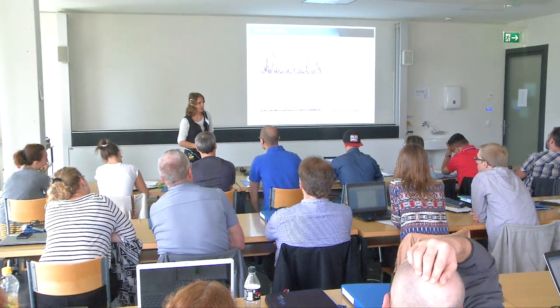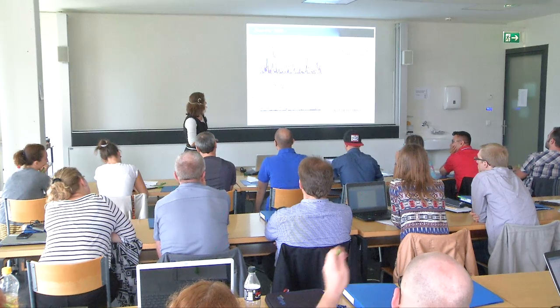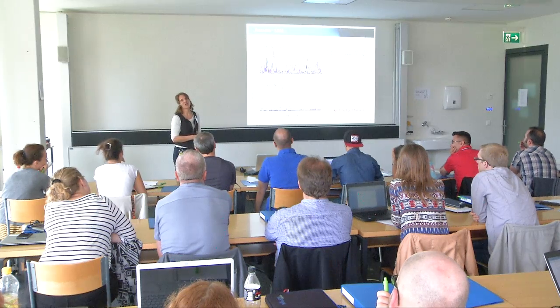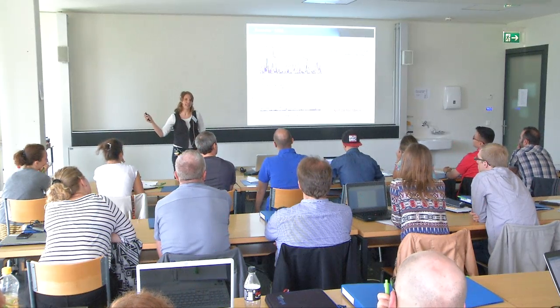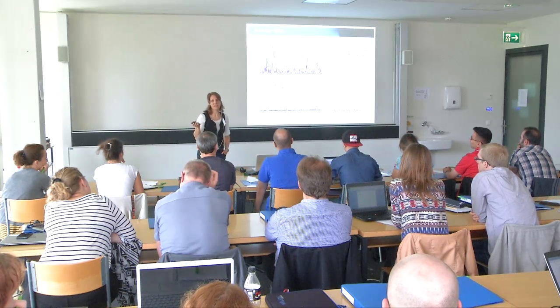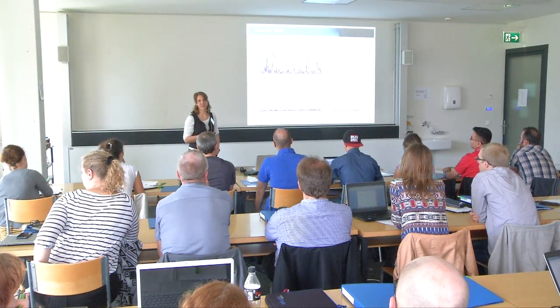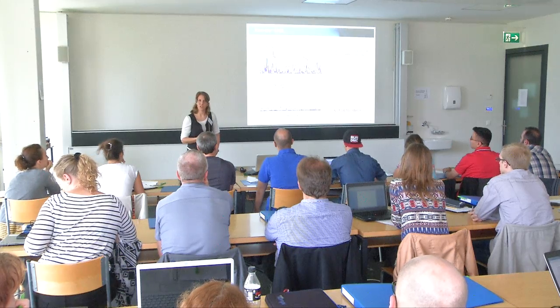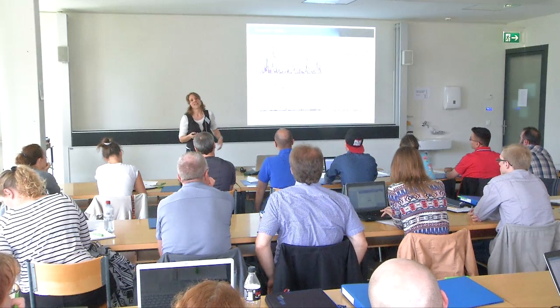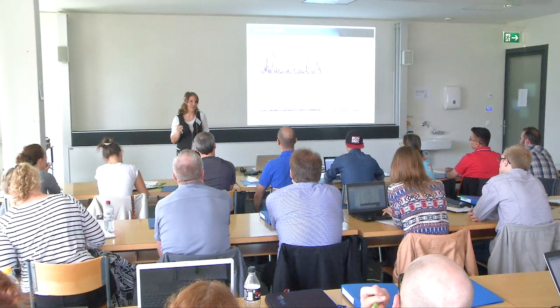Yeah. So when I do this manual analysis in Skyline, I never do this. One problem is that this intensity threshold, if you apply one, is very different depending on the retention time you're looking at. At the end of the gradient, you can have very beautiful peaks with an intensity of below 1,000 counts per second, while this is completely noise at a retention time of 20 minutes where there are many, many peptides eluting. So the background intensity is very much chromatography dependent. This is why I always had a problem applying something like this. You would need to do it in a retention time defined manner.